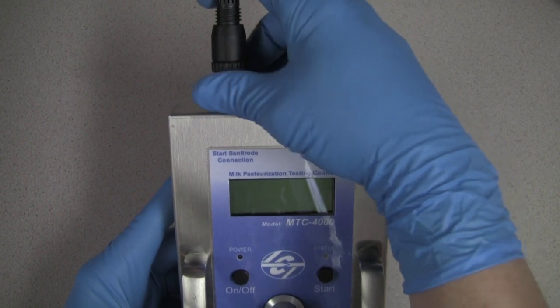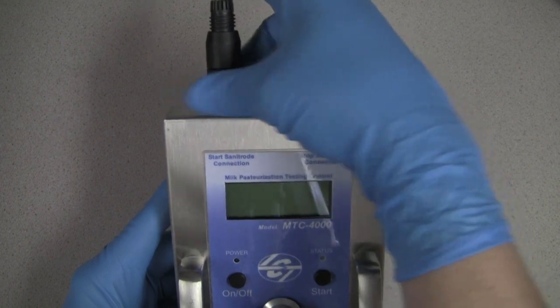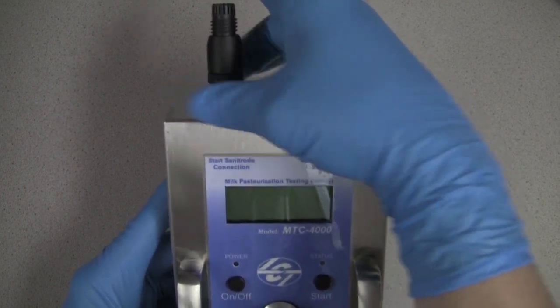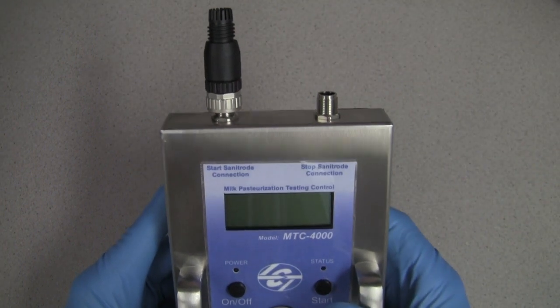You will then apply firmer pressure while turning the stainless steel outer metal ring clockwise to tighten it down into the MTC4000. Once it's snug, the connection is good.